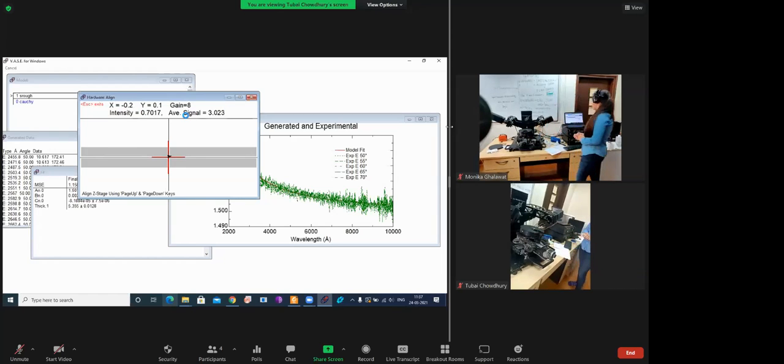Okay, we'll wait for 1-2 minutes. If it is not there, we'll cancel this because they are not optically smooth. But generally, if you have optically smooth glass, you can go for it. With the help of any kind of marker, you can just make the black background, and you can go for it.